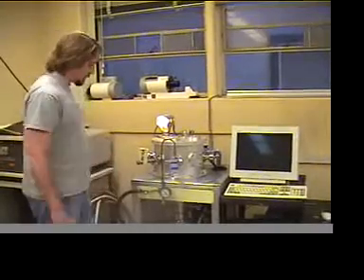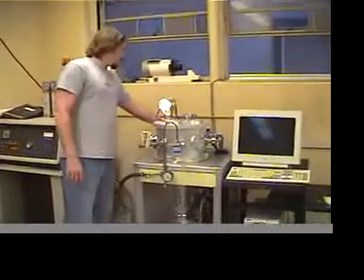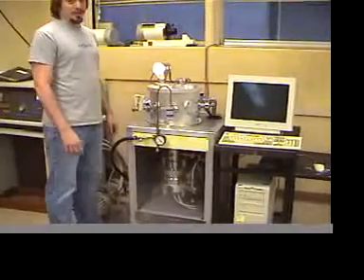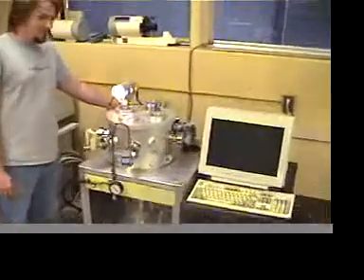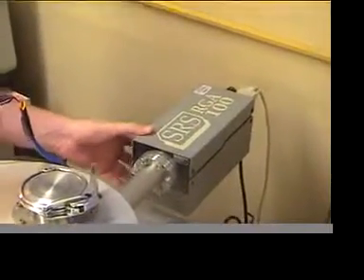At the heart of this experiment is the Stanford Research Systems Residual Gas Analyzer, which you see right back here. This residual gas analyzer is a quadrupole mass filter.